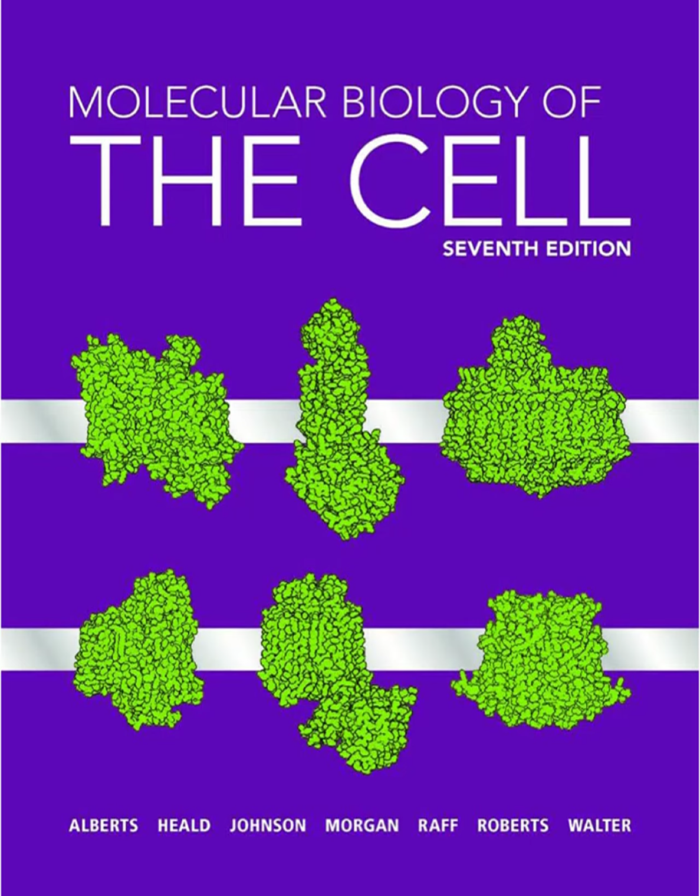Low dose to avoid damage. Right. Then the software goes to work. It identifies the individual particle images, computationally determines their different orientations, sorts them into classes based on viewpoint, aligns the images within each class, and then averages them together. Averaging thousands of noisy images cancels out the noise. Precisely. It dramatically increases the signal-to-noise ratio.